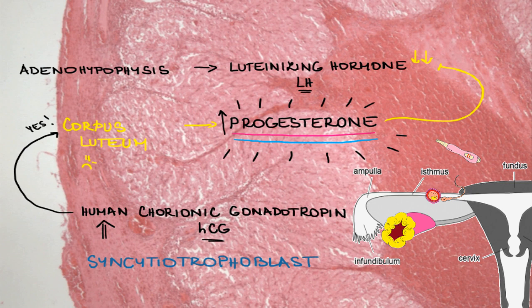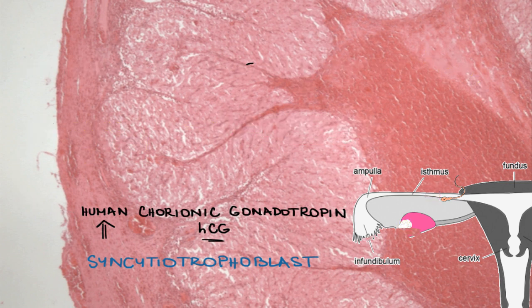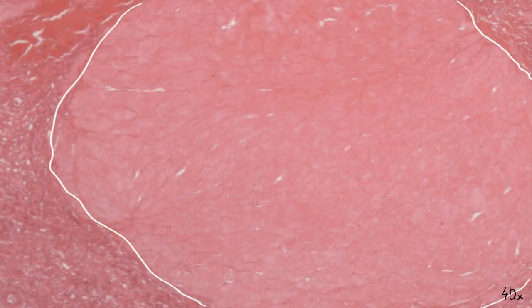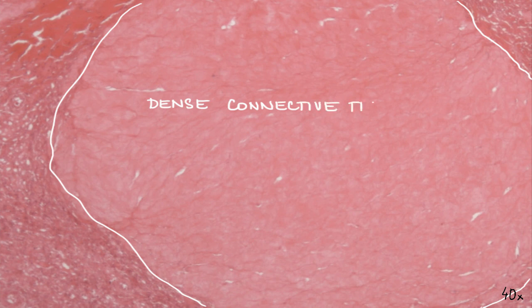Cells of the corpus luteum, having done their job, undergo programmed cell death — so-called apoptosis. This process results in a structure called the corpus albicans, from Latin 'whitish body.' There is a corpus albicans in the section of the woman's ovary — it is a pale whitish structure made of dense connective tissue. After some time, remnants of the corpus albicans are phagocytosed by macrophages and replaced by connective tissue from the cortex of the ovary.